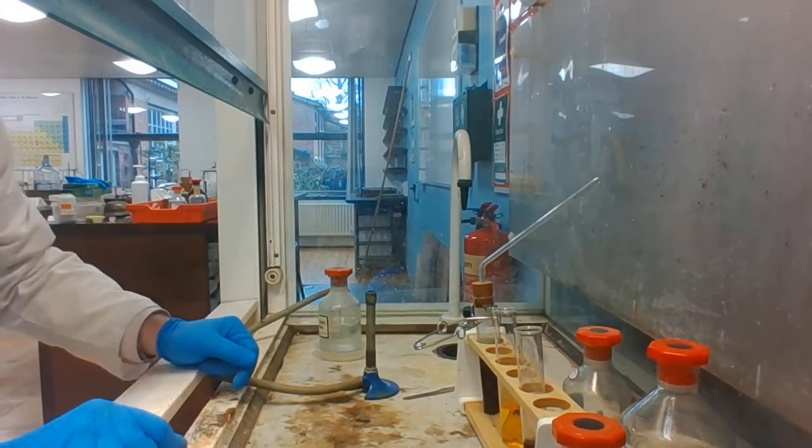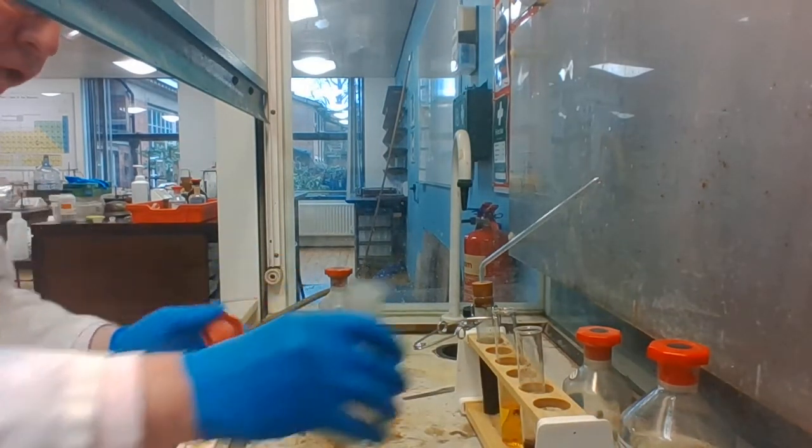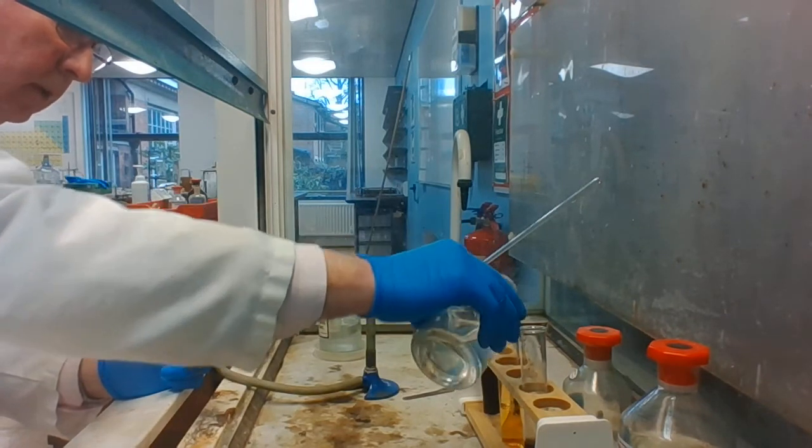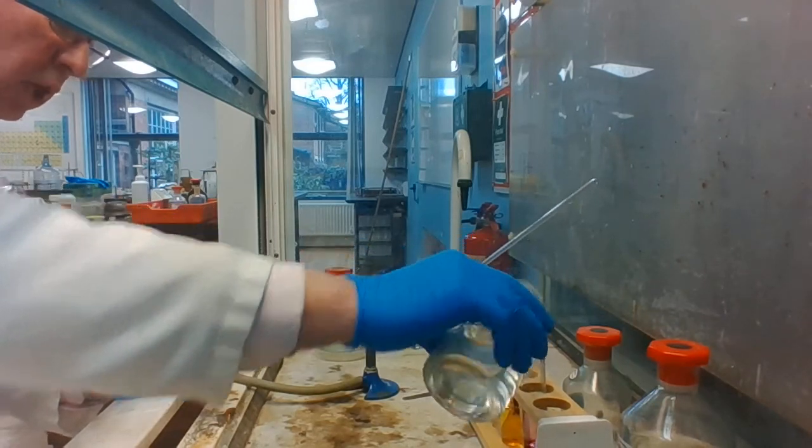To try and show that the halogen has been produced, I'm going to add some cyclohexane to both tubes. Cyclohexane is immiscible with the aqueous solution.